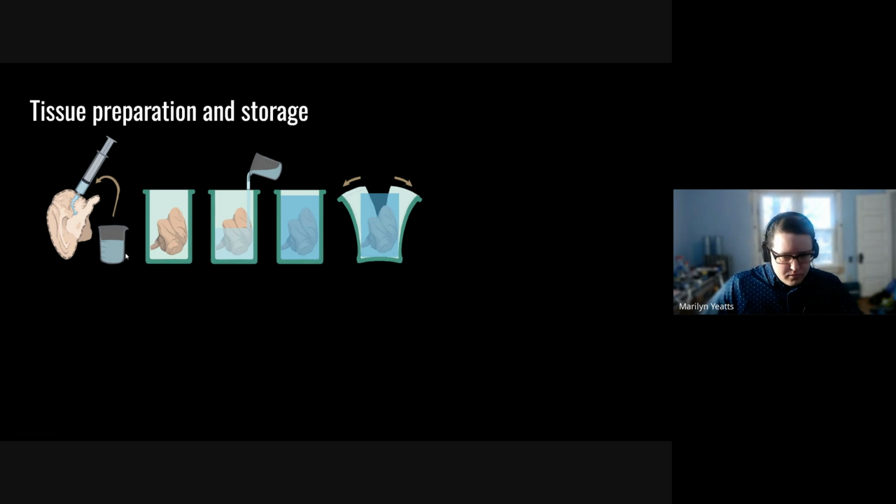And when I say liquid agar gel, this is low melting point agar gel, which is available through Precisionary or through other retailers. And the percentage will vary depending on which tissue you're interested in doing. And we can come back to percentages of the agar gel if that's something of interest.